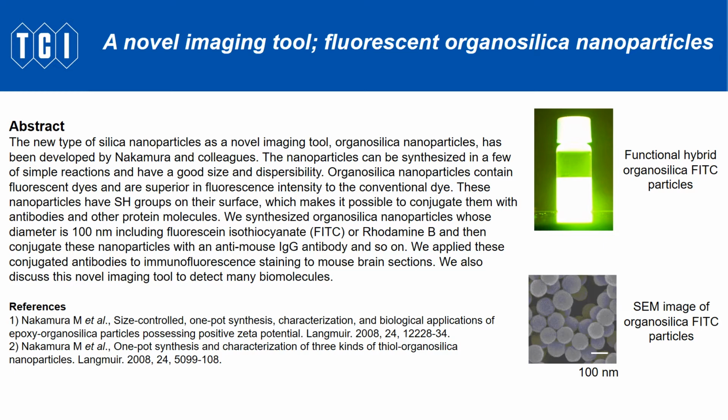nanoparticles with an anti-mouse IgG antibody and so on. We applied these conjugated antibodies to immunofluorescence staining of mouse brain sections. We also discussed this novel imaging tool to detect many biomolecules. The upper image is the functional hybrid organosilica FITC particles, and the lower image is the SEM image of organosilica FITC particles.